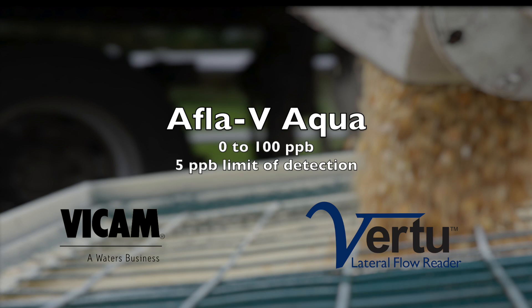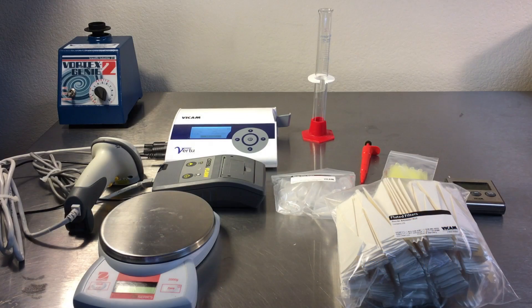The Virtu Lateral Flow Strip Reader Kit includes the Virtu Strip Reader with a barcode scanner and printer, a vortex mixer, scale, graduated cylinder, and pipetter.